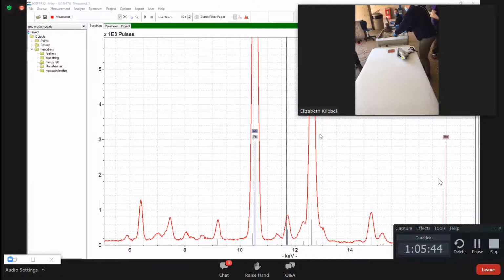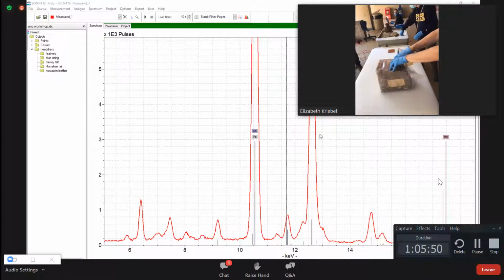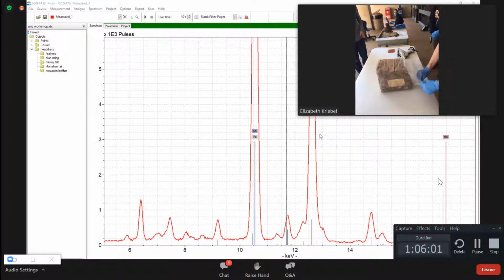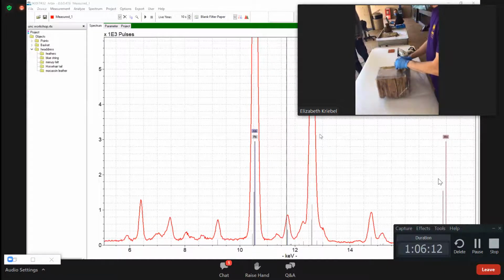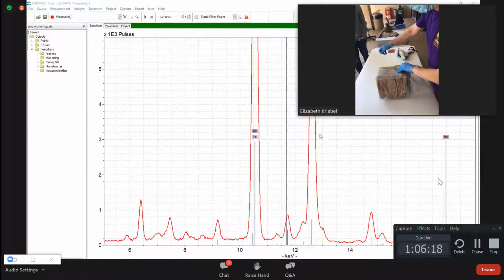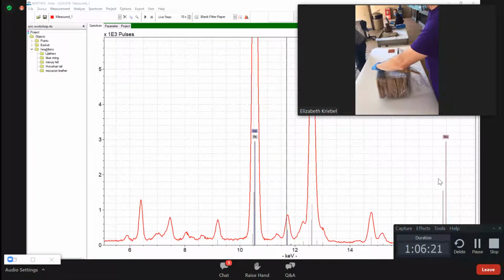Now here's a question for the novices at home, which includes me. Something wrapped in plastic: we don't want to measure it that way, because the plastic's going to block X-rays from getting out. For lead and mercury, we would see that just fine, but for lighter elements like chlorine, we wouldn't necessarily see through the plastic, assuming the plastic doesn't have anything that's going to activate an XRF either. This really shouldn't be in plastic, but this came to us this way. We don't know why. Sometimes things were wrapped in plastic in the past when they had mold or something on them. I don't know in this case if that's the situation.